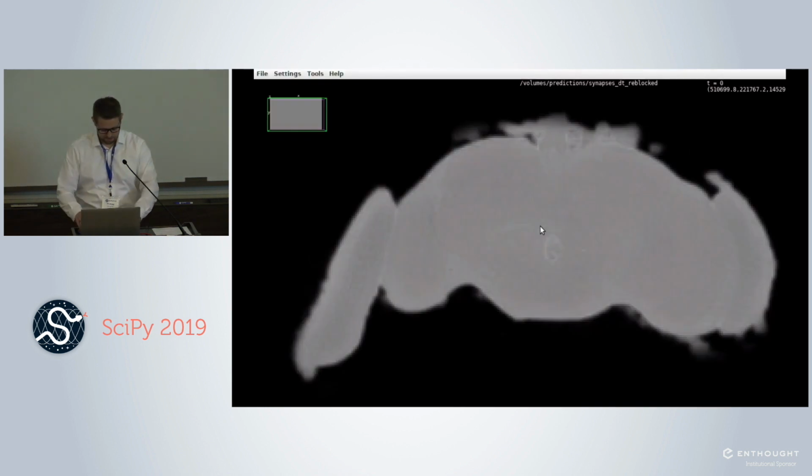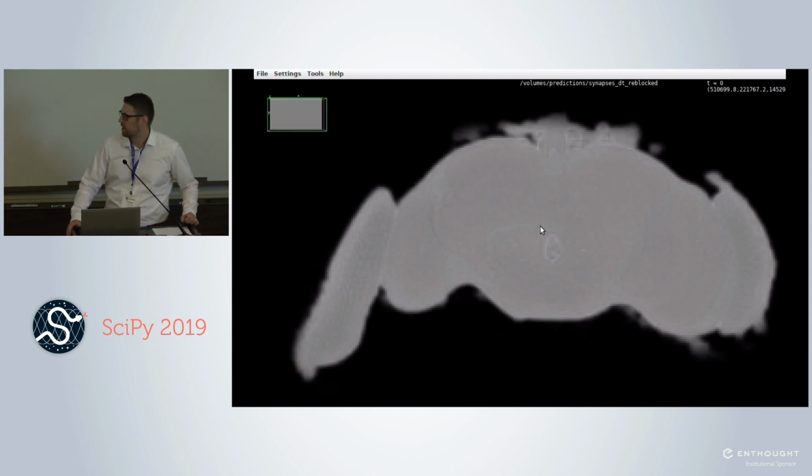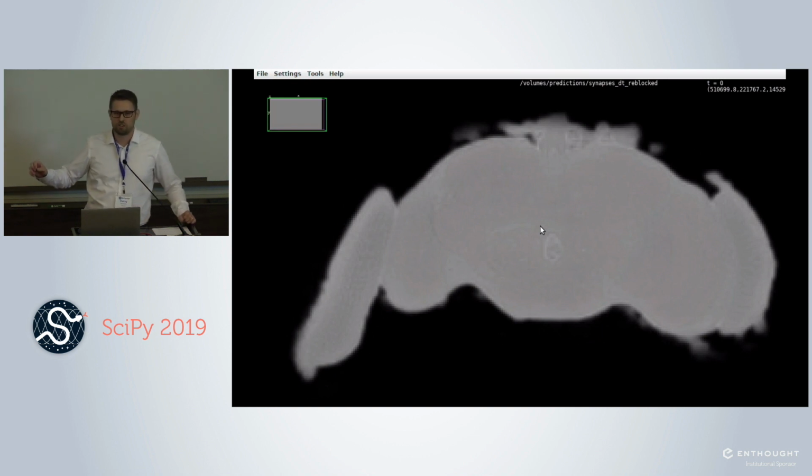So I will demonstrate to you BigDataViewer in this little video, and I will show you how we can very freely and easily navigate this data set. This is an electron microscopy acquisition of a whole adult fly brain, and it is about 100 teravoxels.